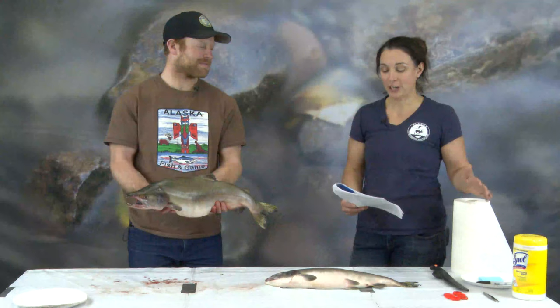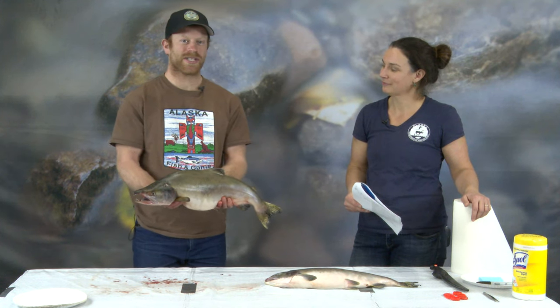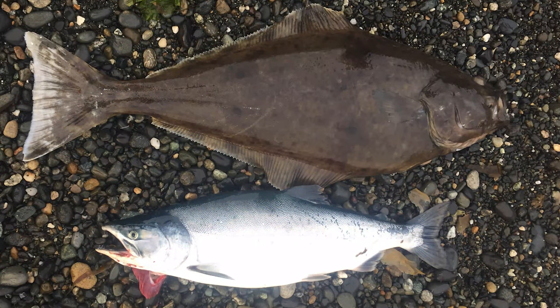Next we're going to go over the fish shape and features. Andrew, what shape is this fish? This fish is the shape of a torpedo. Fish are shaped this way so they can swim easily through the water with the least resistance, versus other fish like a halibut that are more flat. It's just a different body shape for different species of fish.